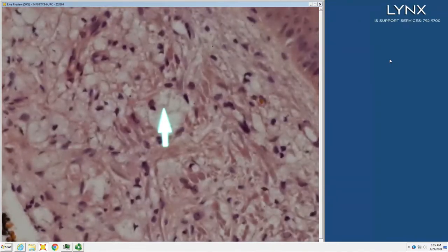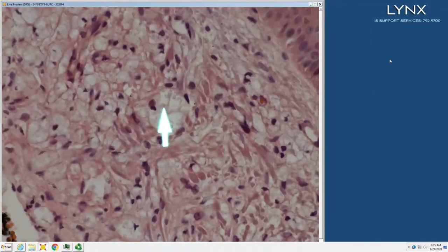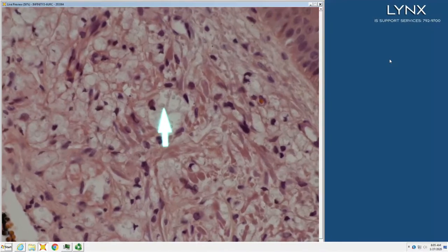So most fungi, everyone is the same size and shape as the next one. Crypto, they're all different in size and shape. Round to oval, and instead of liking single family houses, they like apartment living, right? They're all together in their gelatinous condominium.